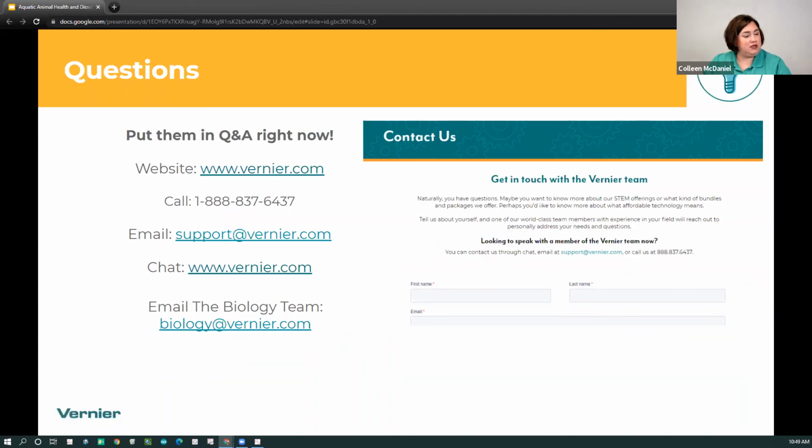So let's see here. I'm actually looking at a couple ones just so people are interested in some questions, some good questions here. One person was asking a question about salinity. Do you have to calibrate for salinity? And so salinity, it's basically a correction factor in there.